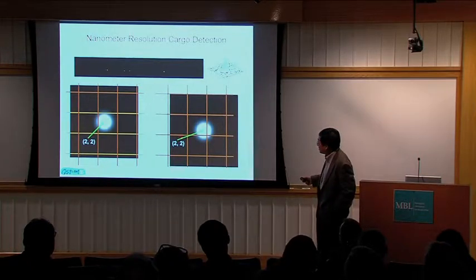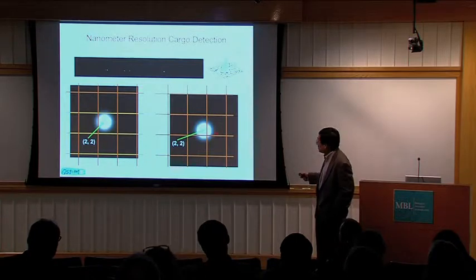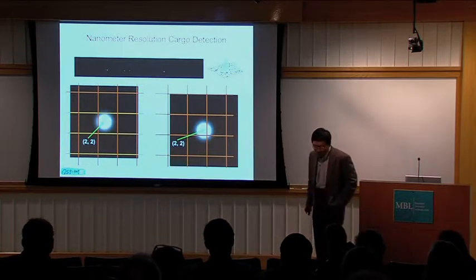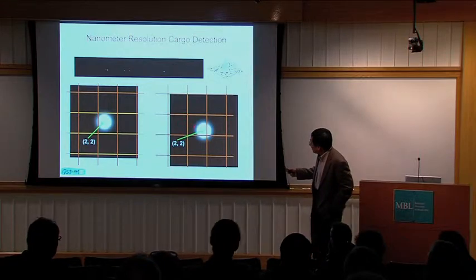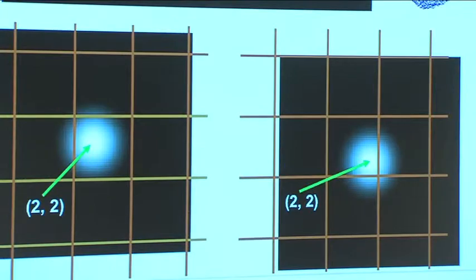What is shown here is, everyone in this room can see that although this is the same bright spot, because of the different profile, the position of this bright particle is close to the upper left here, whereas this one is close to the lower right. So intuitively, this is how the point spread function works to resolve the location of this particle beyond the resolution of a single pixel. This is a general technique. We can combine it with different imaging modalities, especially the STORM imaging modality.